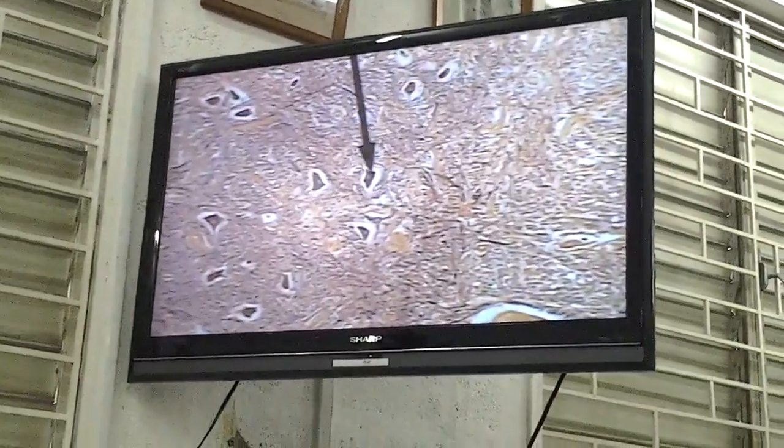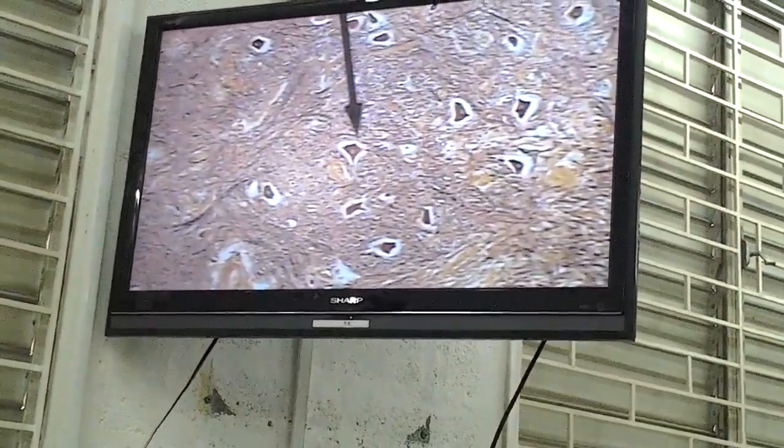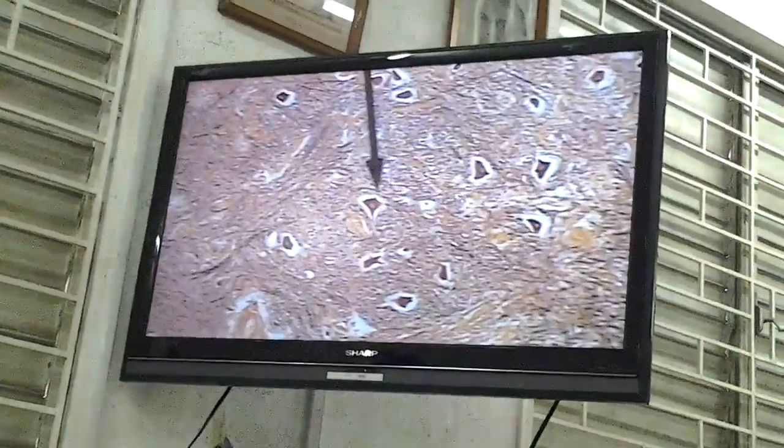So once again, another one slide. I'm very fortunate that all the slides I'm picking up every 5 minutes.